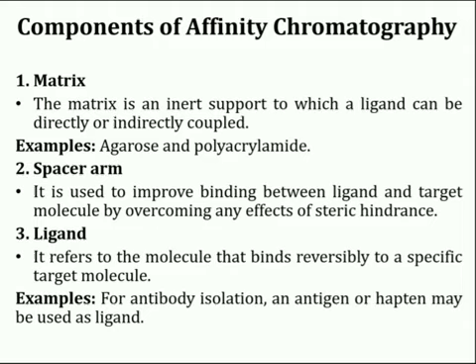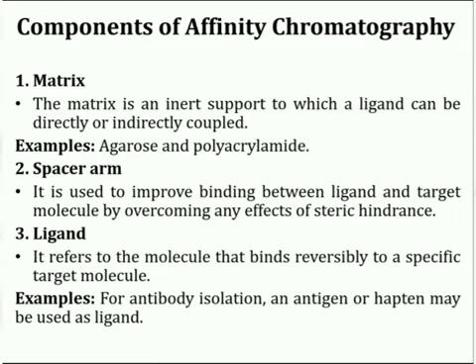It should be chemically and physically inert. It must be insoluble in solvents and buffers employed in the process. It must be easily coupled to a ligand or a spacer arm onto which the ligand can be attached. And last, it must exhibit good flow properties and have a relatively large surface area for attachment. Examples of matrix material include agarose and polyacrylamide.